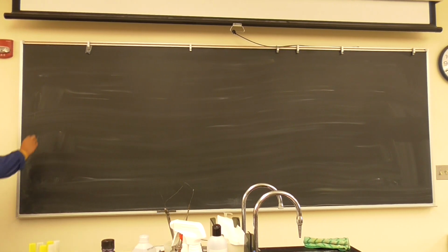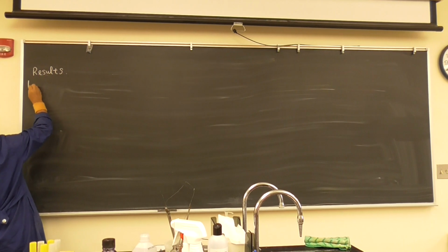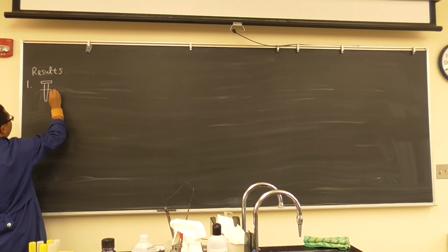So let's talk about something first. First of all, let's go over the results from last lab. It's not difficult. Number one, everybody have a broth. You should have a broth.